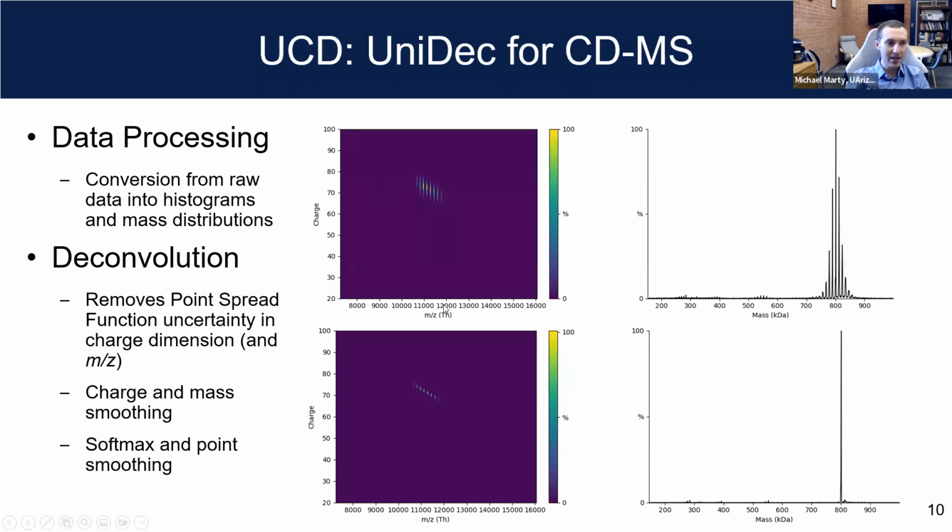So it'll now read data, and you can not just read data and deconvolve it, but apply the same UniDec algorithms to sharpen up those peaks. Naturally the data has a fairly large charge spread, and that's what leads to all these different satellite peaks. But when you apply UniDec, you can smooth it up and you get this one really nice peak. I think we were pretty excited. To our knowledge, this was the first real software developed for CDMS at all. Everybody else had been using custom scripts and things. So this gave a nice user interface that's open source and that other people can develop.